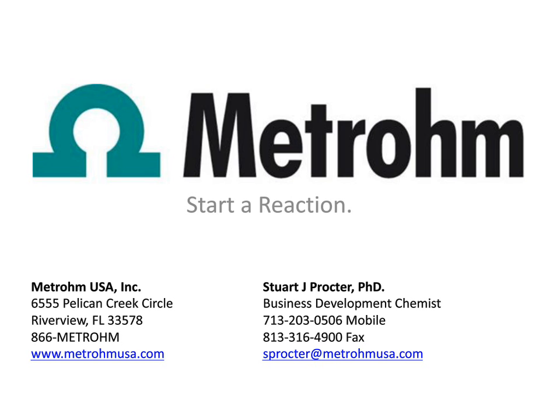However, because of some new sorbents that have come onto the market, people have been analyzing PAHs in hamburger or PCBs in milk. It's definitely expanding into the other areas. I know Joni mentioned many others as well, but science tends to expand its way into other areas, useful science. Yeah, good point. Great, thank you.